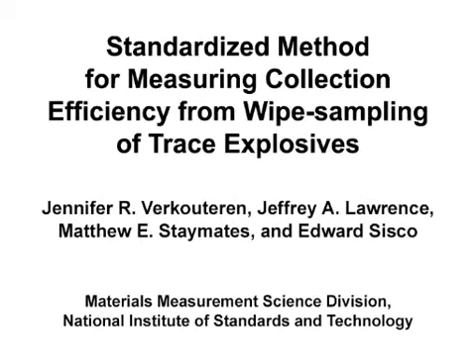The overall goal of this wipe sampling methodology is to provide a standardized way to measure collection efficiency. This method can help answer key questions in the surface wipe sampling field, such as how to best detect traces of explosives. The main advantage to this technique is that it minimizes operator variability compared to other techniques that measure sampling efficiency.